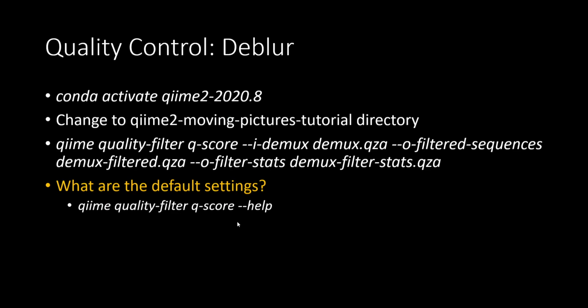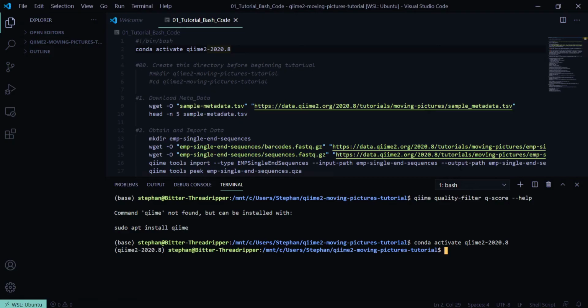This command is essentially going to help us for anything. If you make a mistake on any of your commands when you're running these files, it's going to tell you that you made a mistake, and it's going to spit out these red arrow codes, and it's going to say, hey, you're missing this command, or you're missing that. And above that, it's actually going to tell you what the command that you wanted to execute does and what the defaults are. And so now that we're in QIIME, we're going to go ahead and press the up key twice and get to our --help.